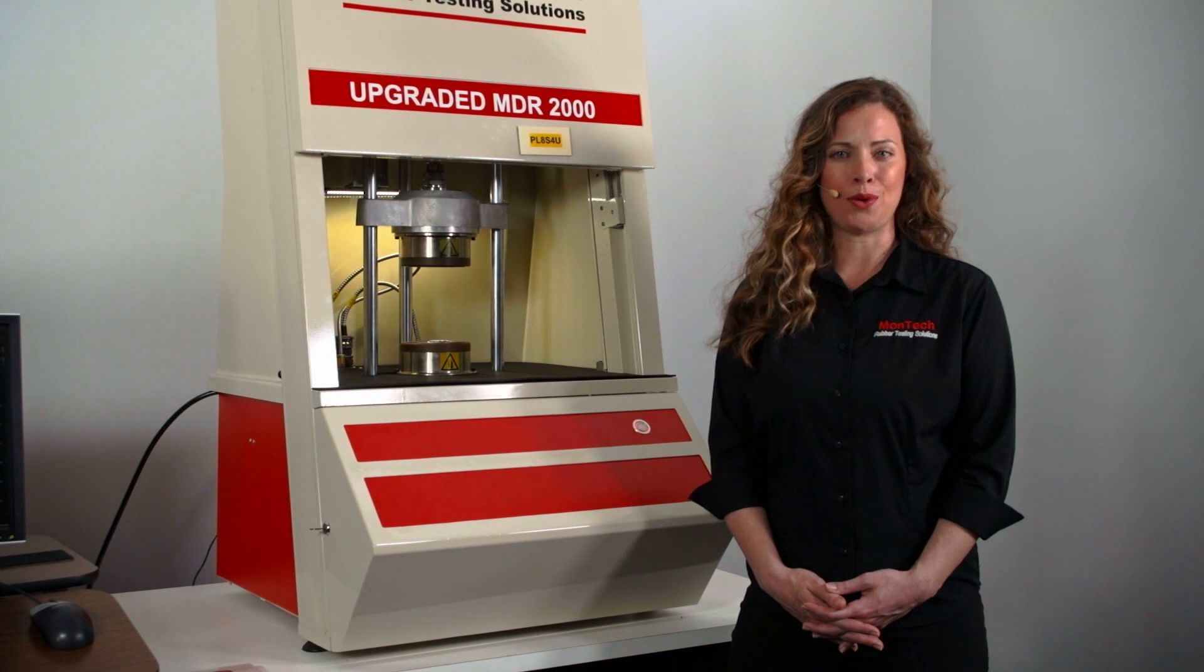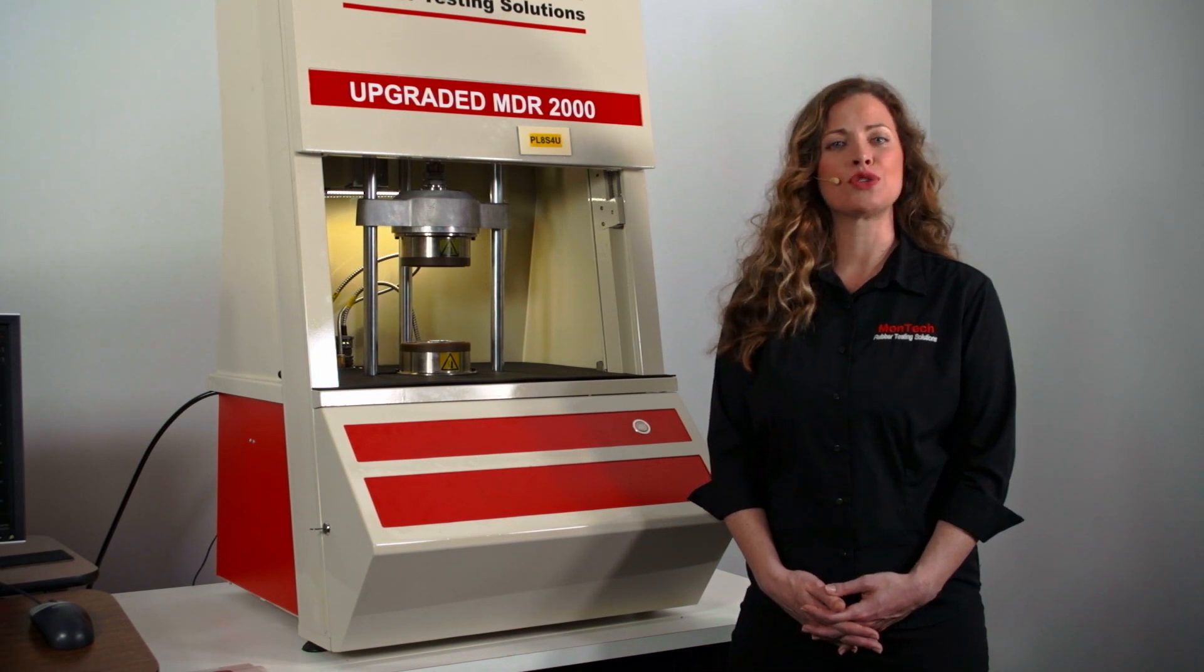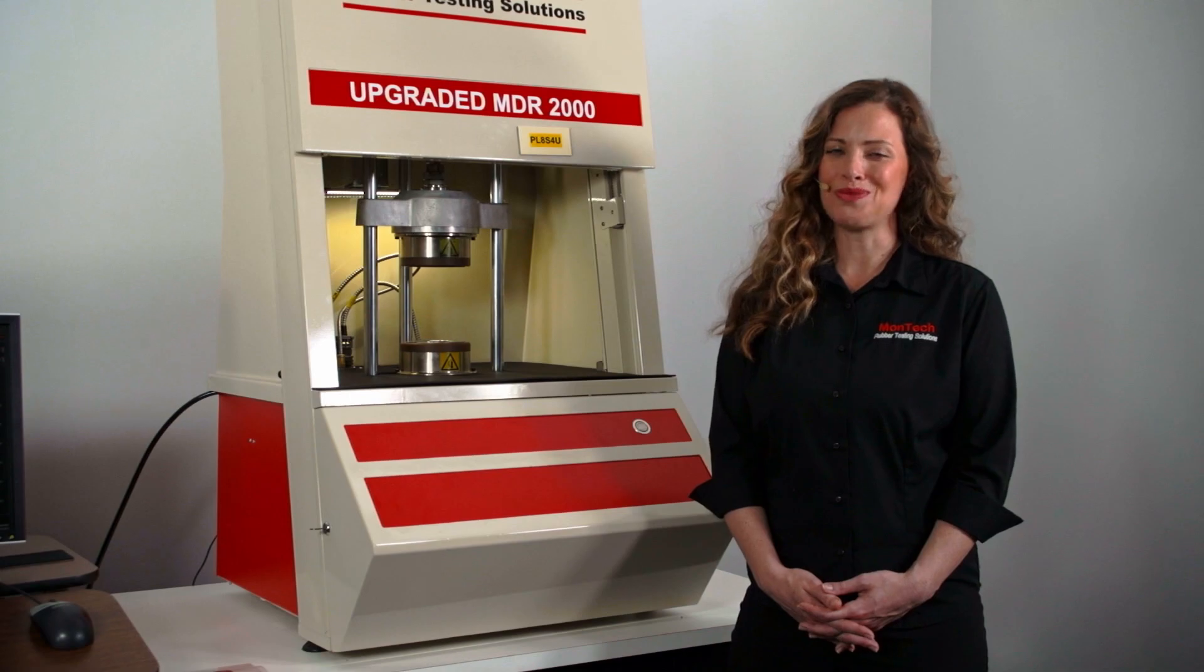The MonTech upgrade price point offers an alternative solution for a limited budget. Contact us to learn more.